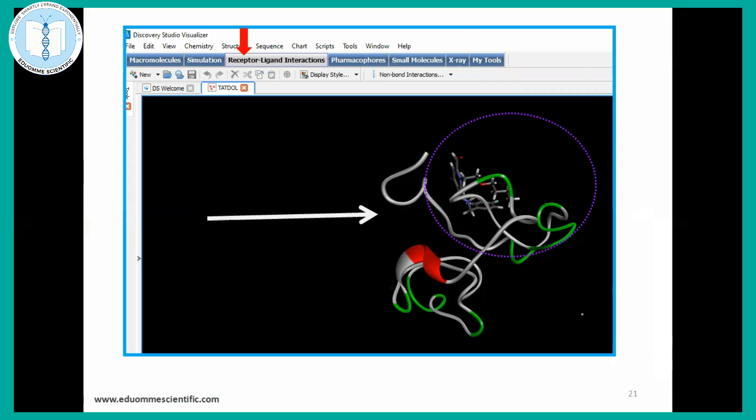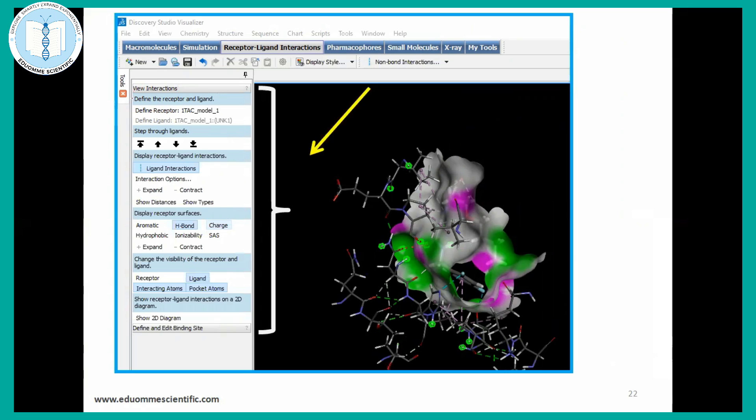If you want to visualize and analyze this structure, you just have to go to receptor ligand here. From here, they have multiple other subsections like view interaction, expand interactions, like different kind of bonds like aromatic bond, hydrogen bond, charges, hydrophobic interaction and all. And the visualization will be shown here. You can get both 3D interaction details and 2D interaction detail also for your docking result and receptor ligand interaction.